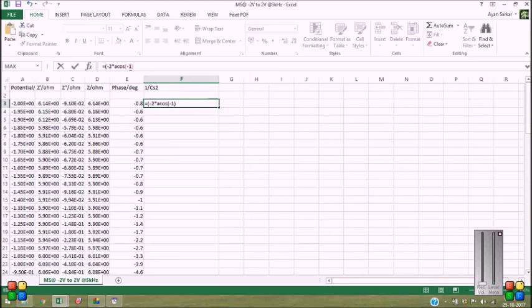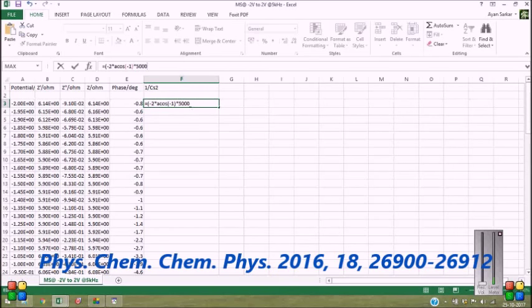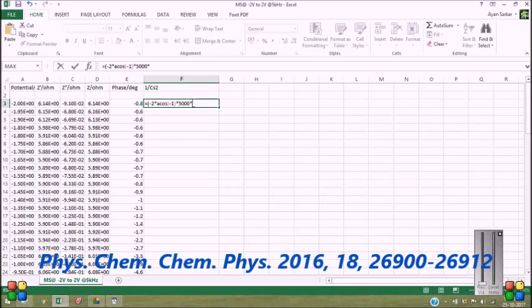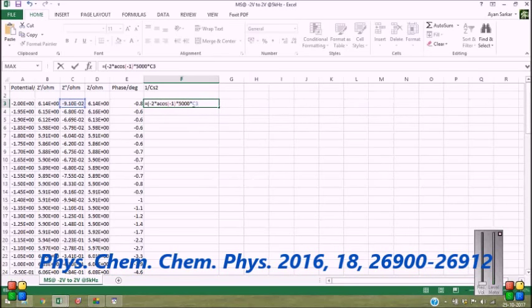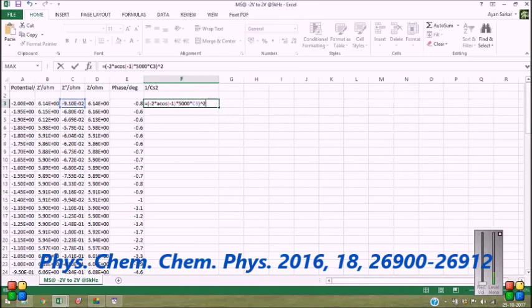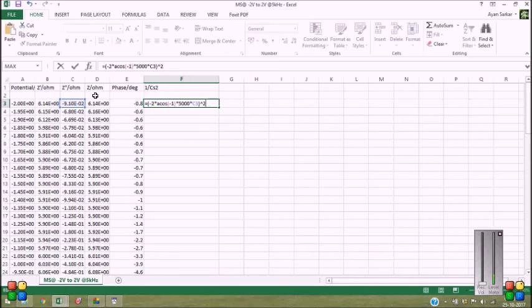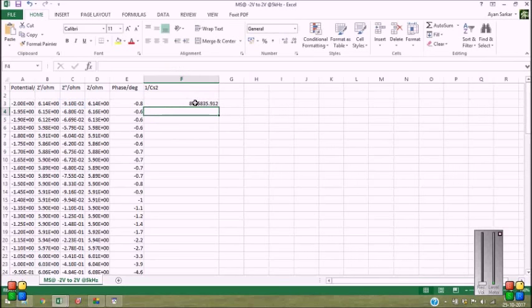2π is fine. Now 5000 is the linear frequency. This actually represents omega, 2πf, and times column 3, that's C3 to the power 2. Yeah, it's fine. It will give you the 1 by Cs square value. Enter.